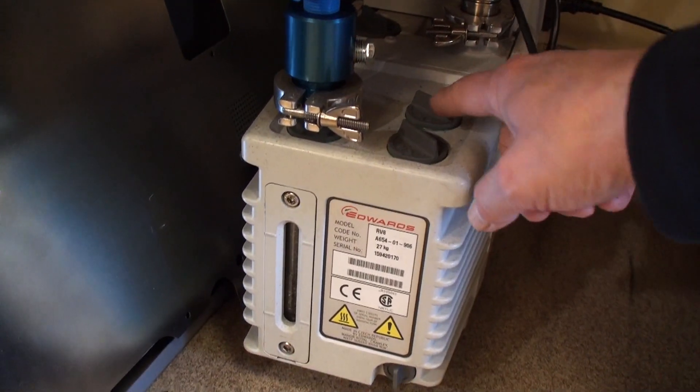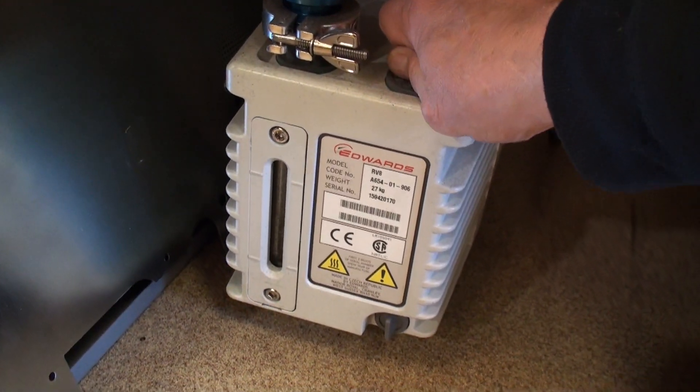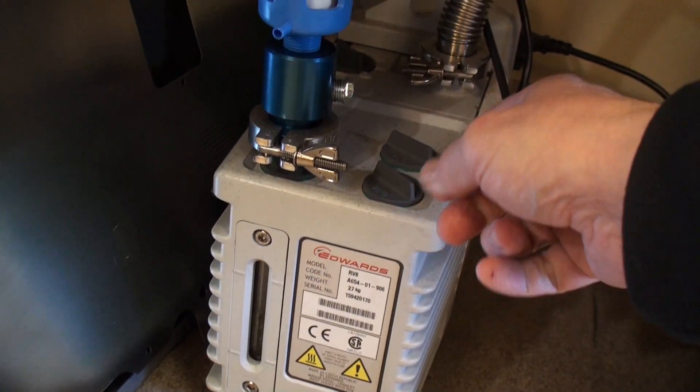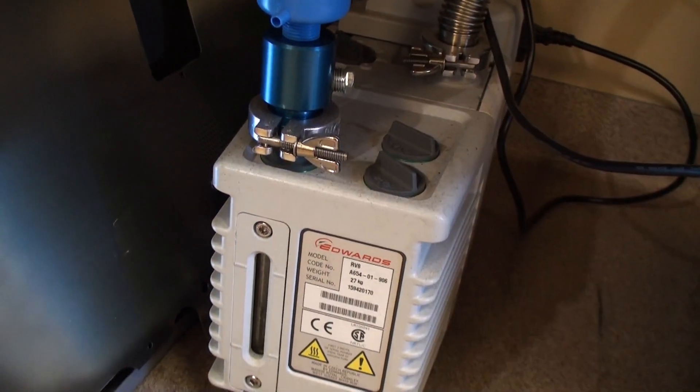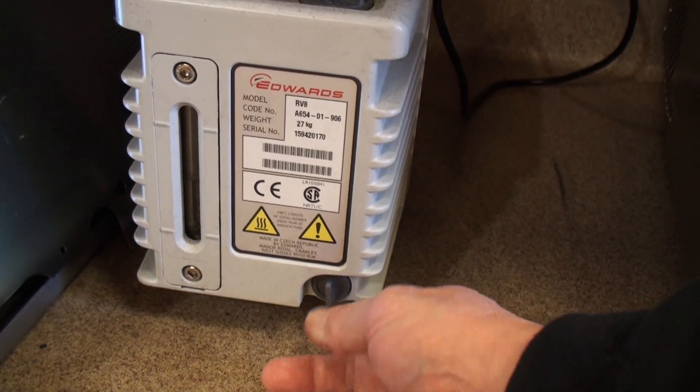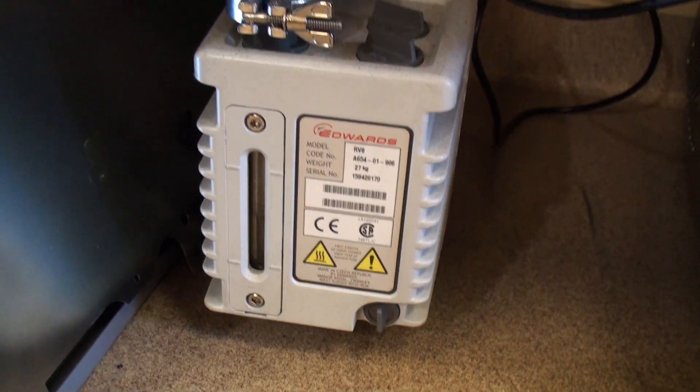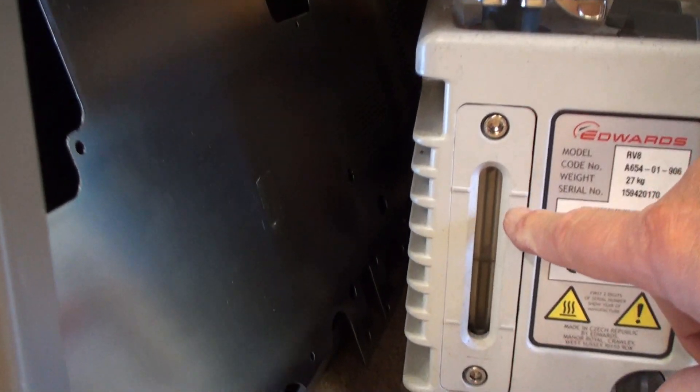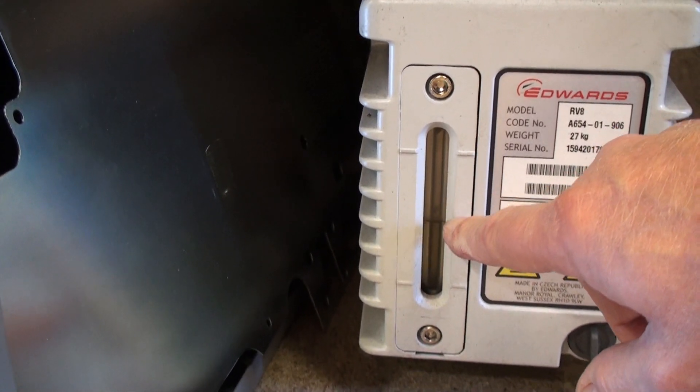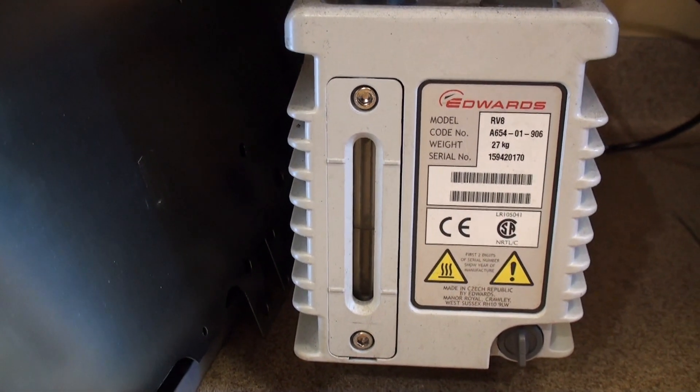These two ports are fill ports and you don't need any special tools, although they are in tight so you might get a pair of pliers to loosen it. This is the drain plug down here. You might need a pair of pliers to loosen that also. Again you have a sight glass and you can see the oil level. Halfway to three quarters is the usual amount of oil that I put in it.